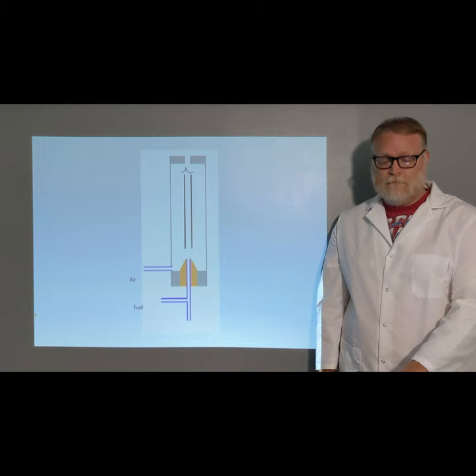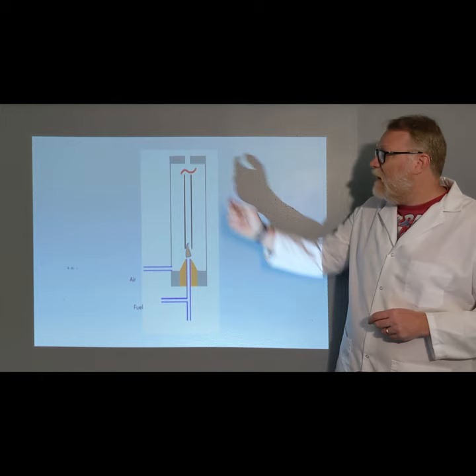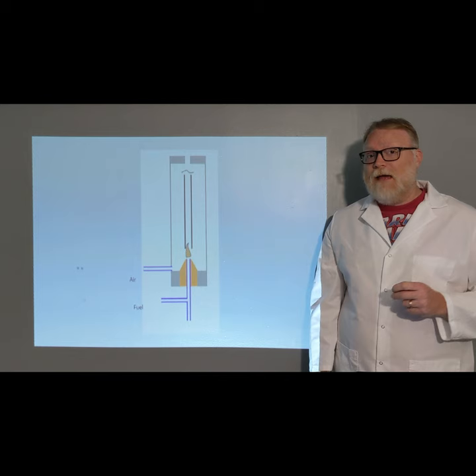When the air and fuel mixture is correct, the heating element is red hot, and then the jet lights, producing a very hot flame. You can see it light up there, and we've got our flame here. You may even hear a pop as the jet ignites.